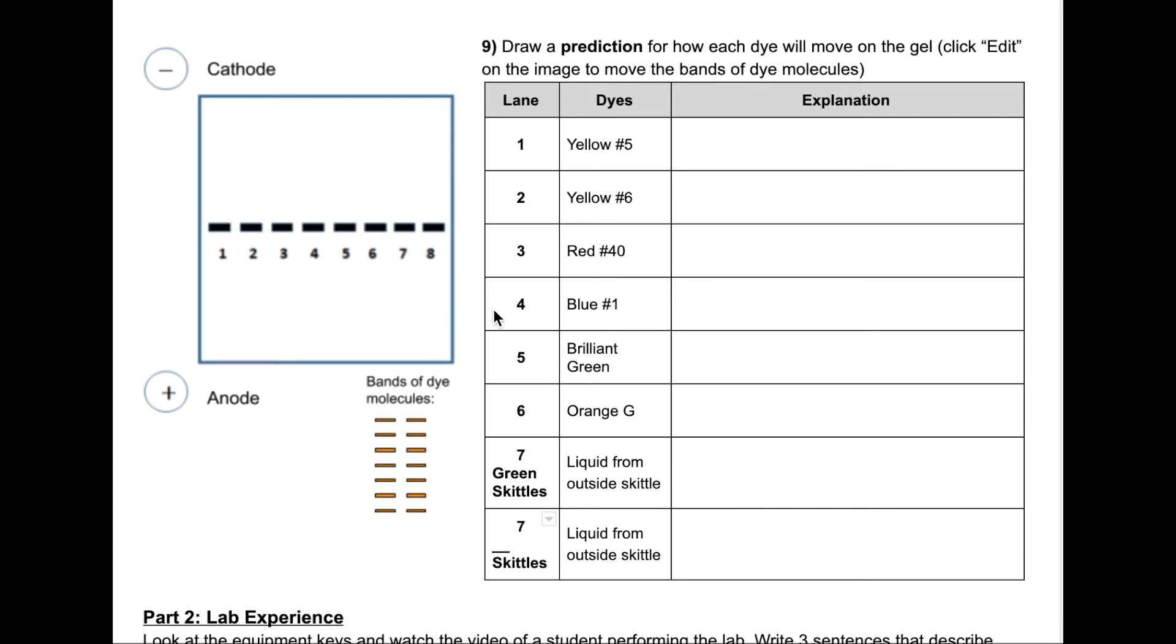In lane number 7, we're going to add the liquid that we got from the outside of the green Skittle. In a separate gel, you'll see results for the different colored Skittles. So if you chose the pink Skittle to make a prediction, you'll see results in lane 7 on a separate gel.